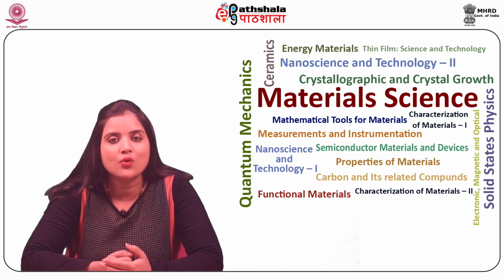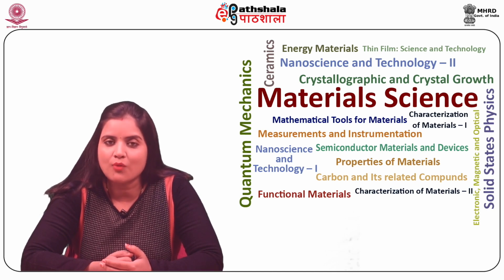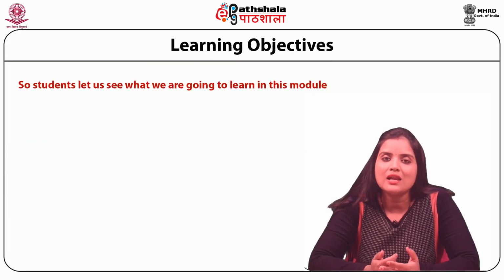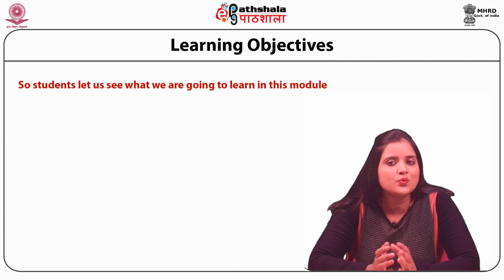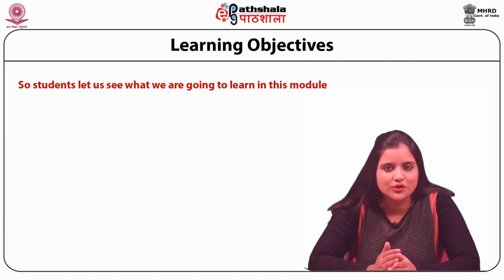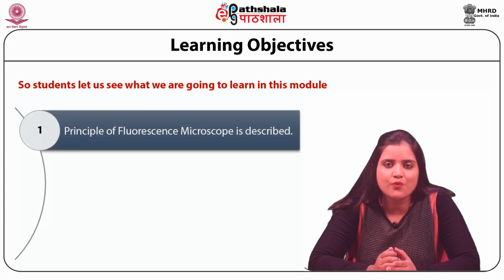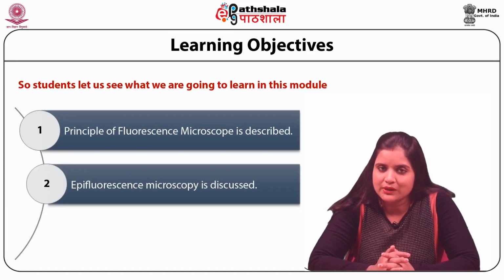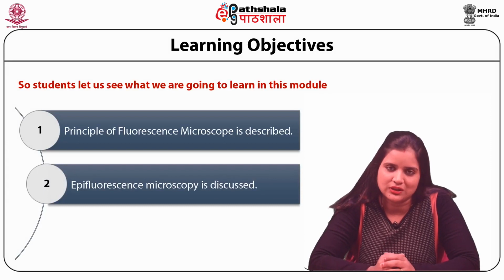Today we are going to discuss the module Fluorescence Microscopy from the paper Characterization of Materials 1. So students, let us see what we are going to learn in this module. In this module, the principle of fluorescence microscope is described. Epifluorescence microscopy is discussed in detail.